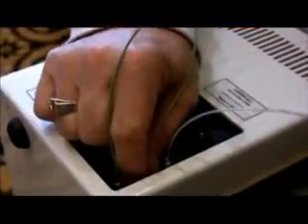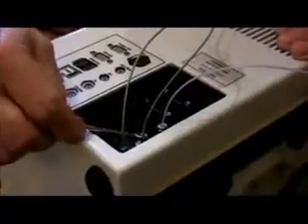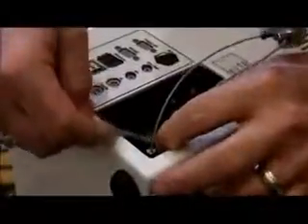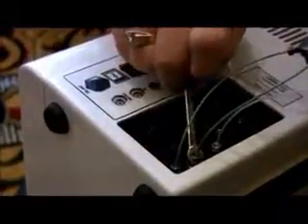Recall we also had a structure on a T for 2 GCs, and this arrangement enables us to use hydrogen for both the carrier gas and the fuel for the FID. And what we're going to do is just put them in either one of those ports, since it's both hydrogen, and it goes together pretty quickly. So now we have both carrier gas and fuel for the flame ionization detector, and what we're going to do is snug these fittings down as well. And it doesn't take much. They seal pretty well. When they get tight, just give it a little bit more of a tug. Not too much. Again, over tightening is nearly as bad as under tightening. You can always find a leak. So just bring it to the point where it feels tight in your fingers. And one more little tug on it, and we're going to call it good.